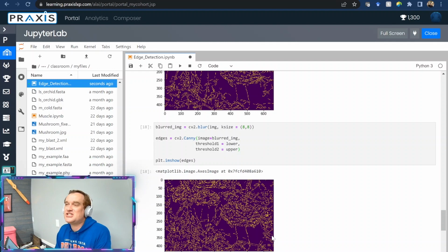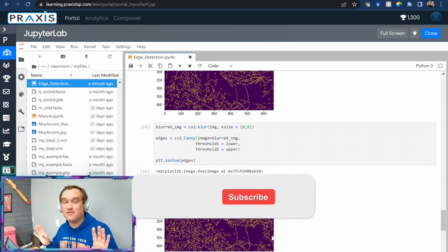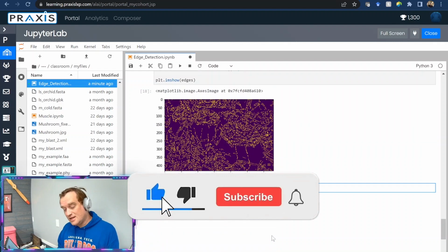It's a useful tool. There's so much of this that can be applied if you're willing to put the time in. Like I said, when I did my spaceflight project for seedling growth, I manually measured 10,000 plus images. Being able to automate this into a reproducible process is useful, because you don't want to introduce measurer error, right? If I measure all the angles and then compare to somebody else, they might not measure the same way. So this gets rid of all the human error in it, and is very useful.